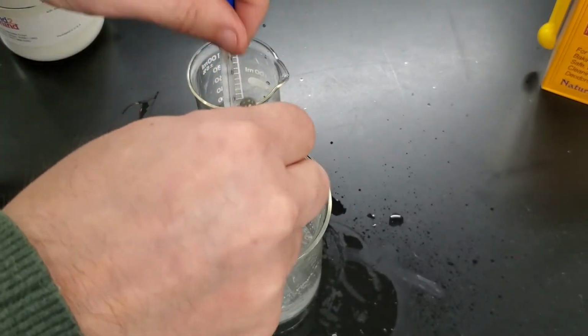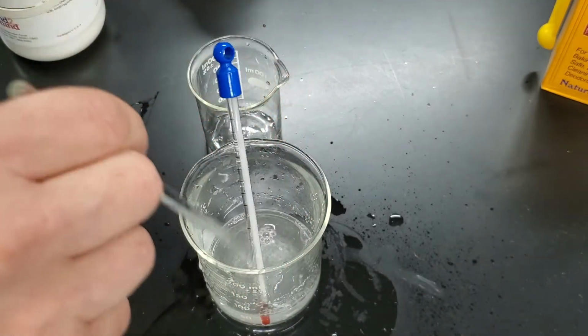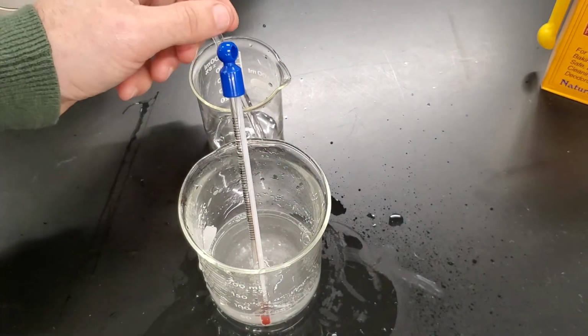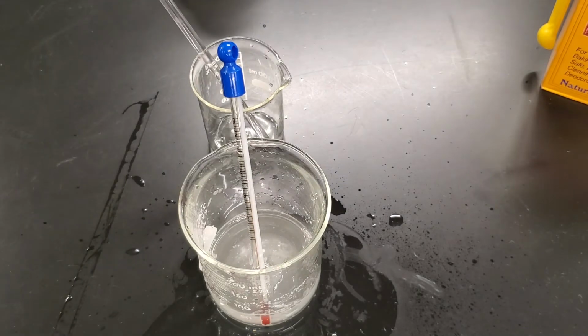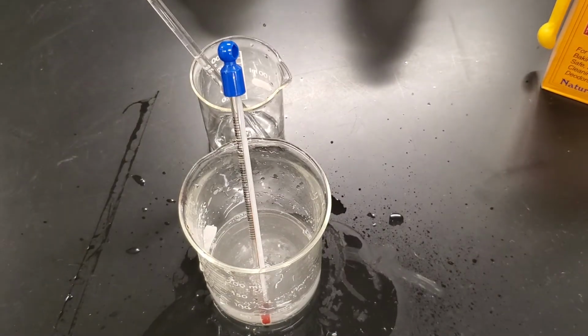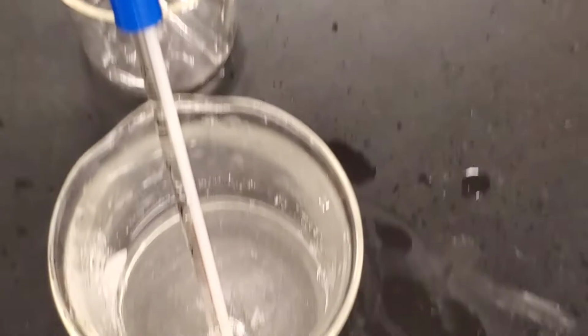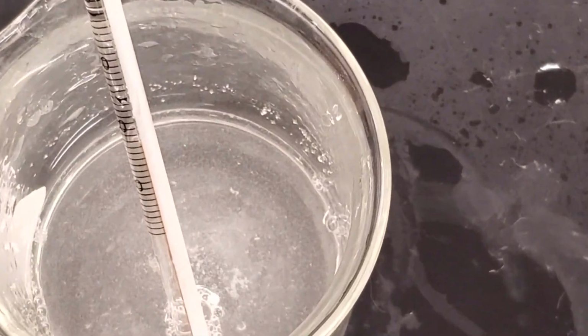I'm going to go ahead and put the thermometer in so it can start reading the temperature as it continues to finish dissolving out. We want to pay attention to any observations or indicators that might be occurring at the moment. So we'll zoom in from the top and see if we see anything.